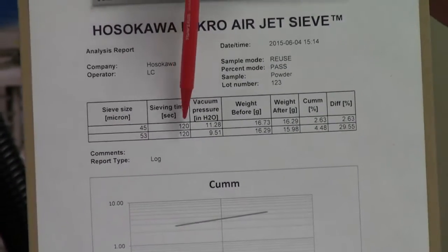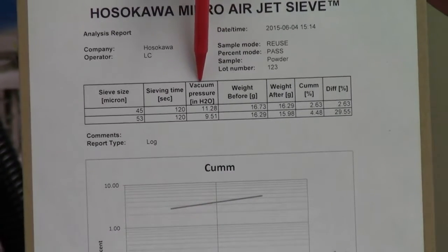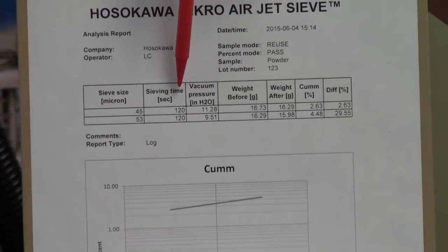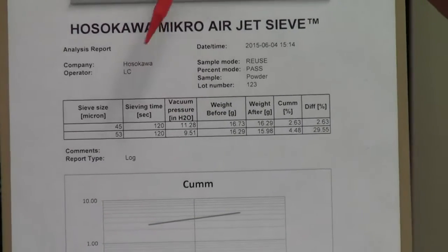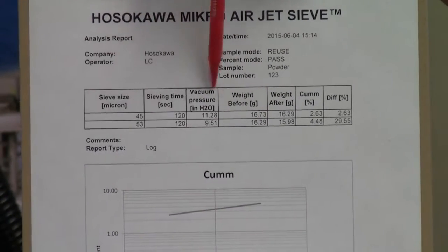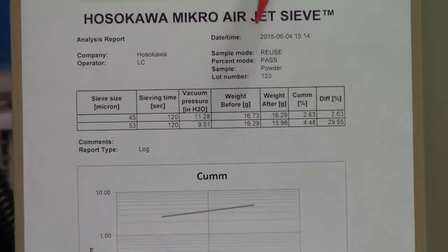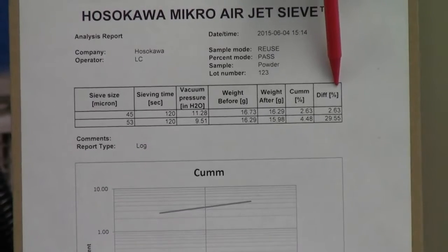We have the sieving time, which we entered as 120 seconds. We have the vacuum pressure. This is the average vacuum pressure that was throughout the entire 120 seconds of sieving. We have the before weight. And then we have the after weight. The before weight, obviously, for each sieve screen that was used, and then after is reweighed. And then we have the percent passing and the percent difference.